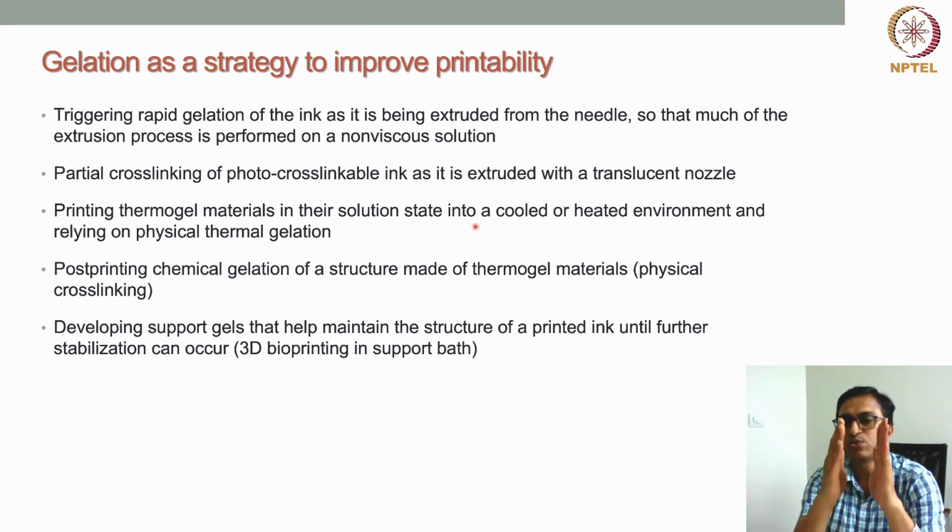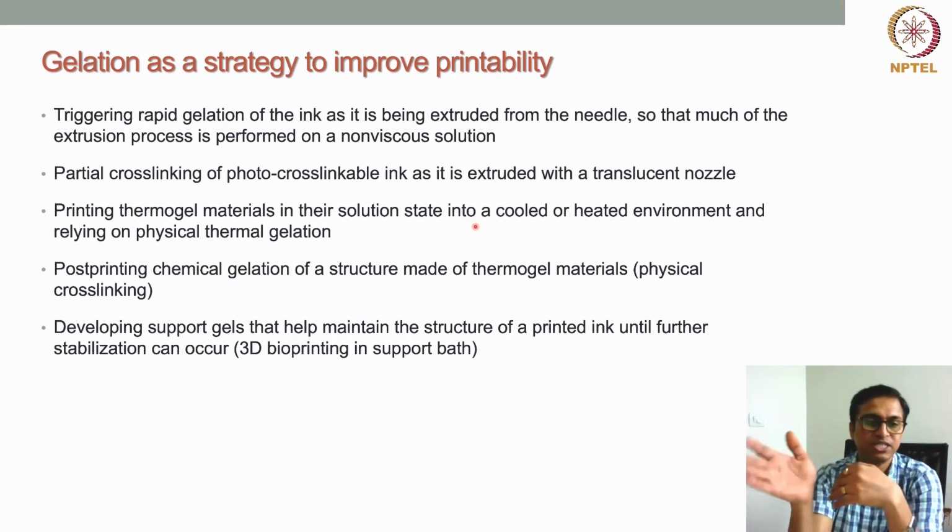During printing we need the material to be in a fluidic state. Accordingly, we can either cool or heat the syringe, but soon after the material comes out, if we can control the outside environment, suppose the temperature of the printing stage, the material would be able to solidify when it touches the surface due to this thermal gelation.